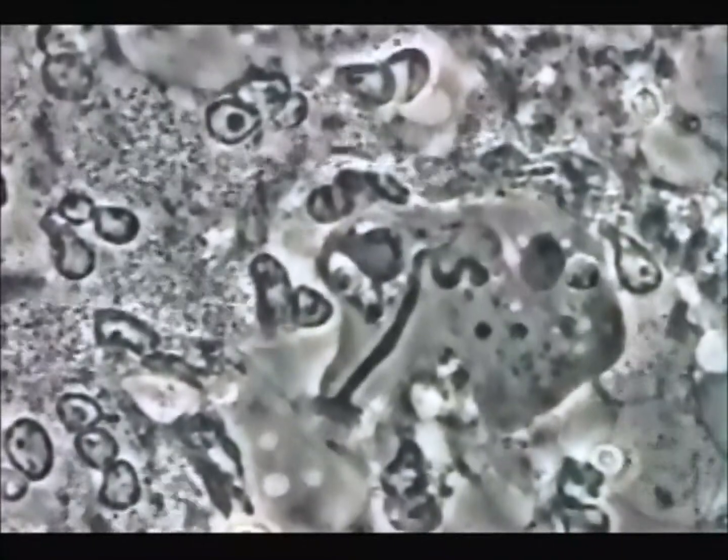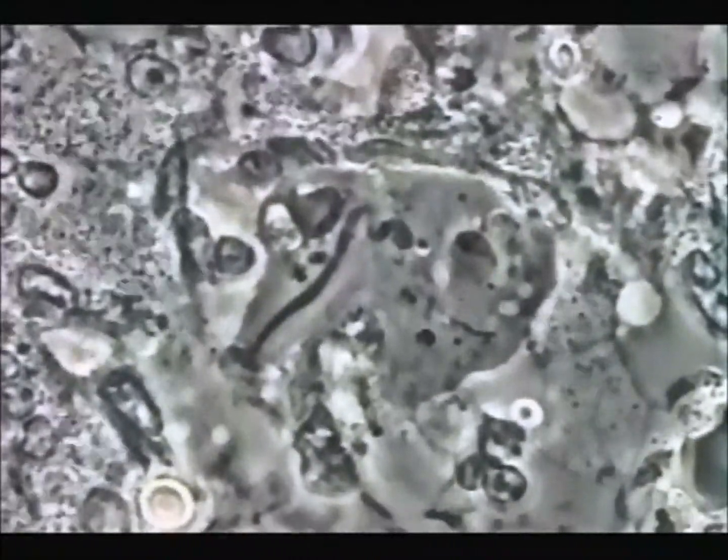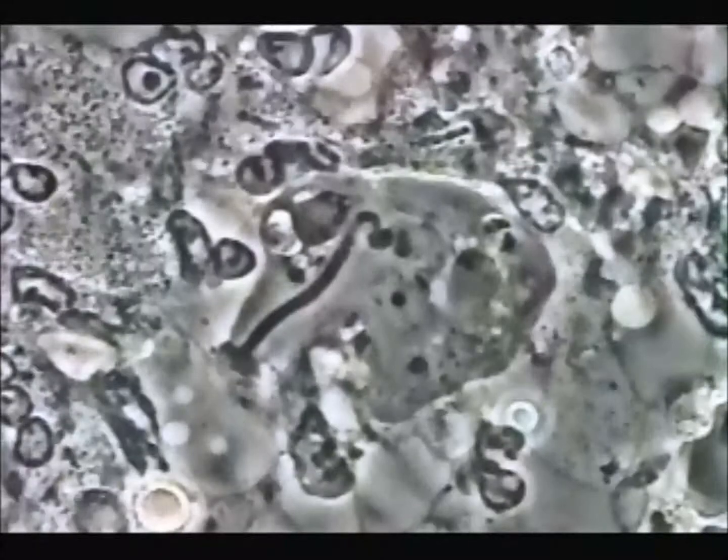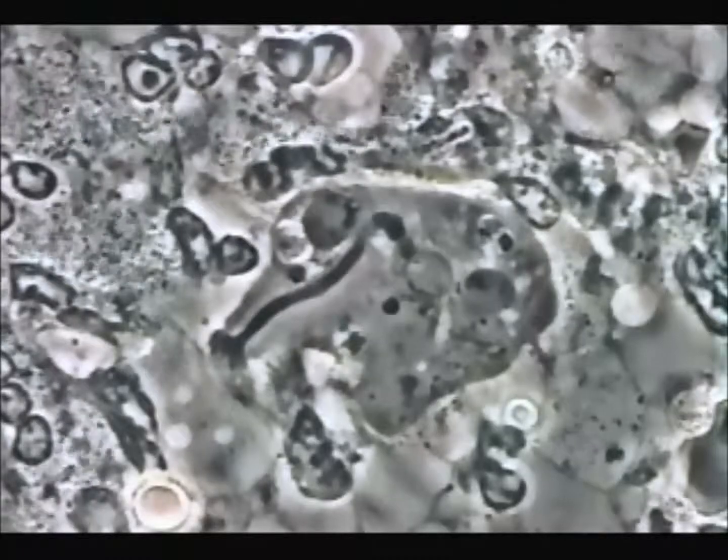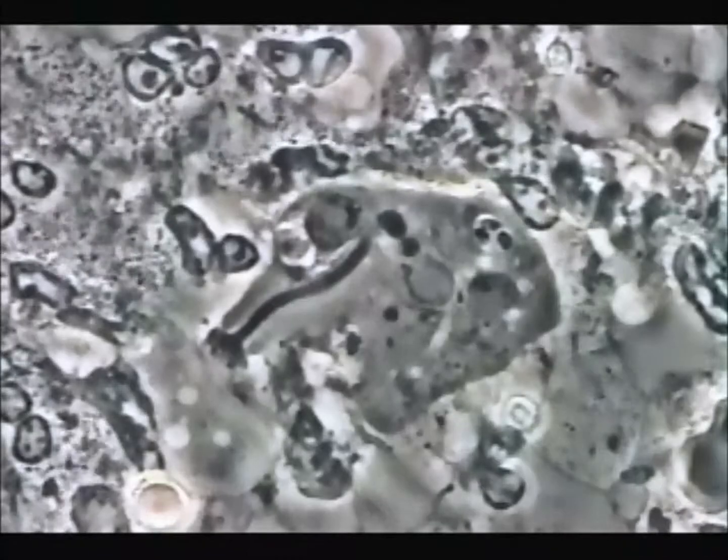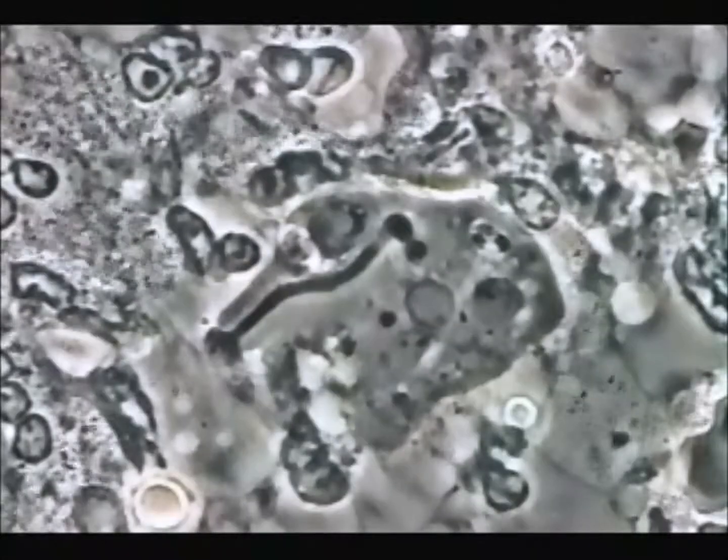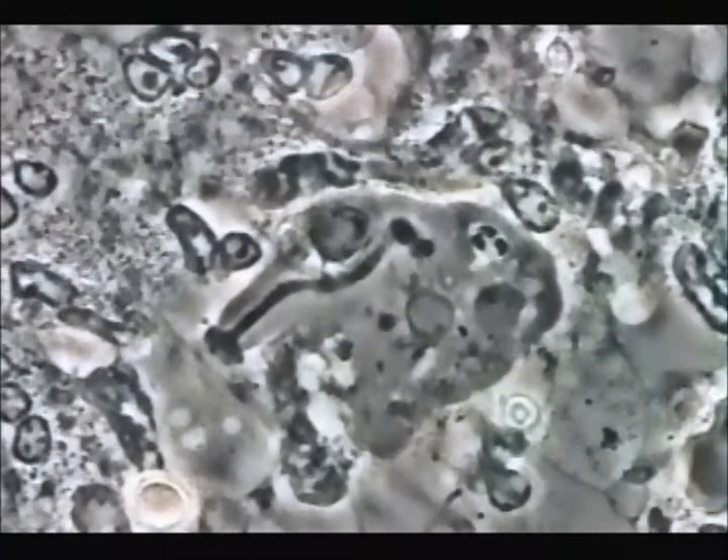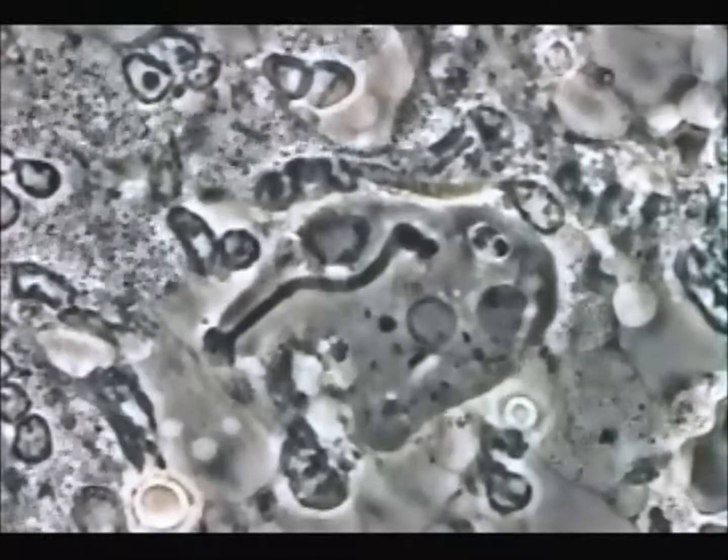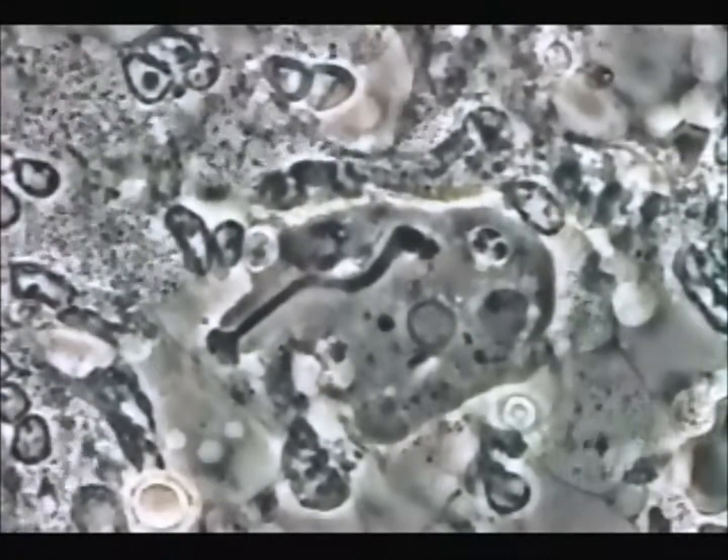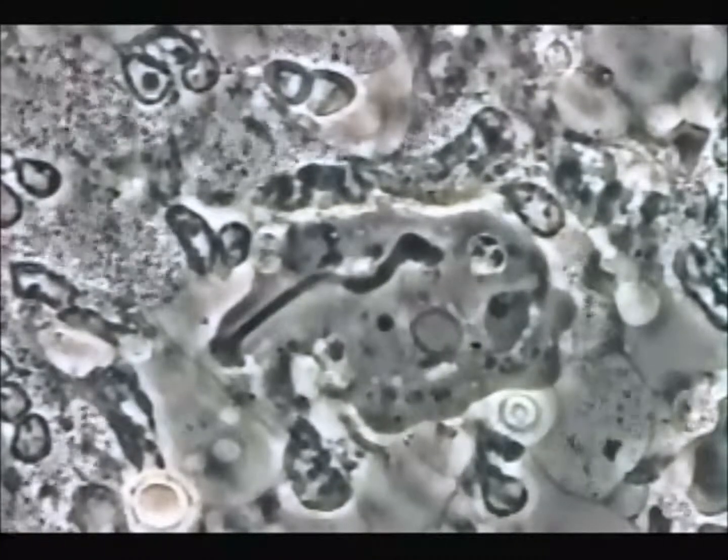Now you see the amoeba in the center which is getting the nucleus from one neutrophil cell. You see that this cell has lost its activity from the granules, and you also see the nucleus membrane in those three little white spots just beneath the amoeba. You see the suction from the pseudopod of the amoeba.